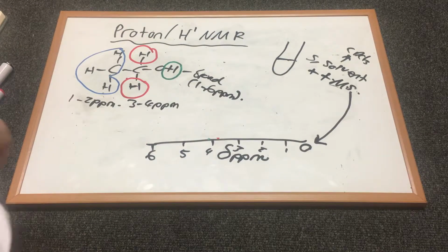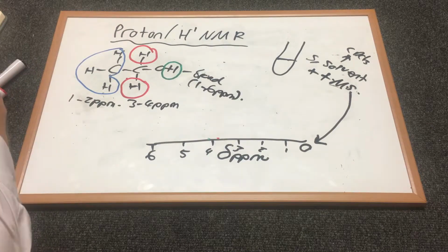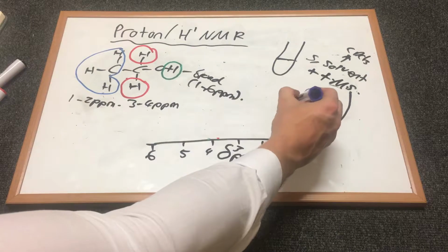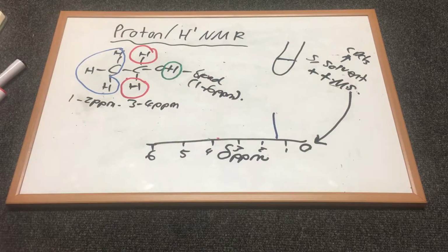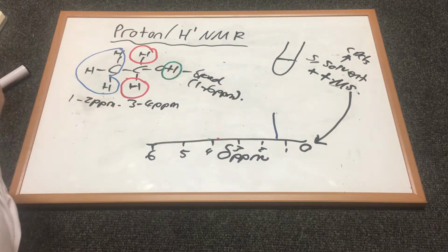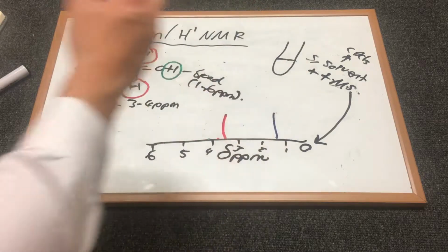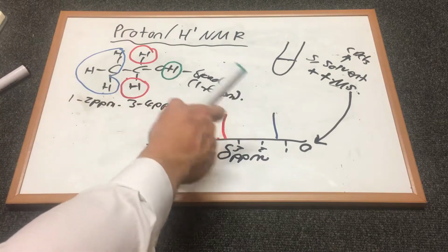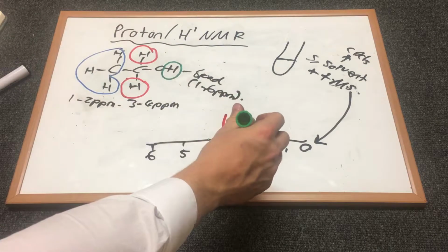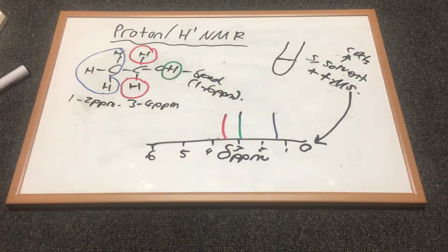Okay, so we'll complete the spectra now in the respective colours. So the CH3 group, I'm going to put a peak there. And the CH2 group, around 3 to 4 ppm, just in the middle there, single peak for that. And finally the broad OH group, 1 to 6 ppm, so I'll aim for about 3. So that is the complete spectra for ethanol.